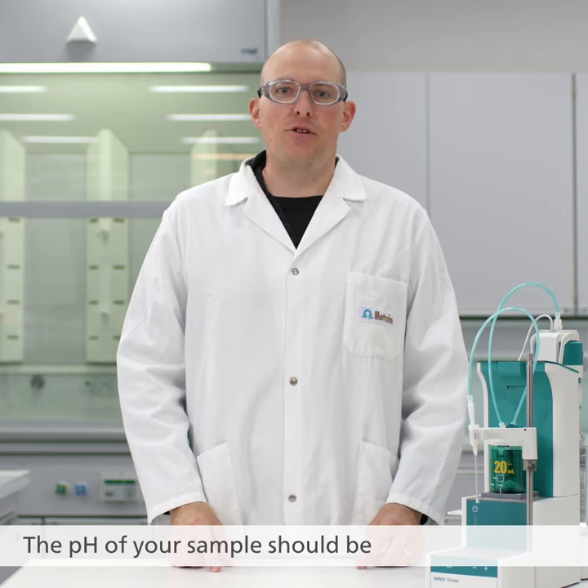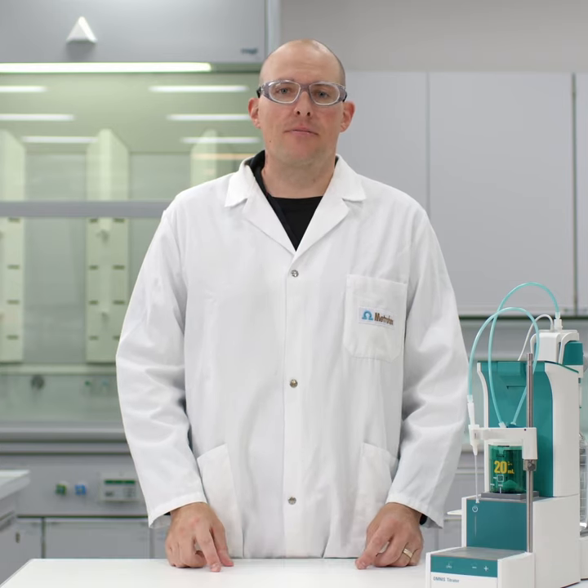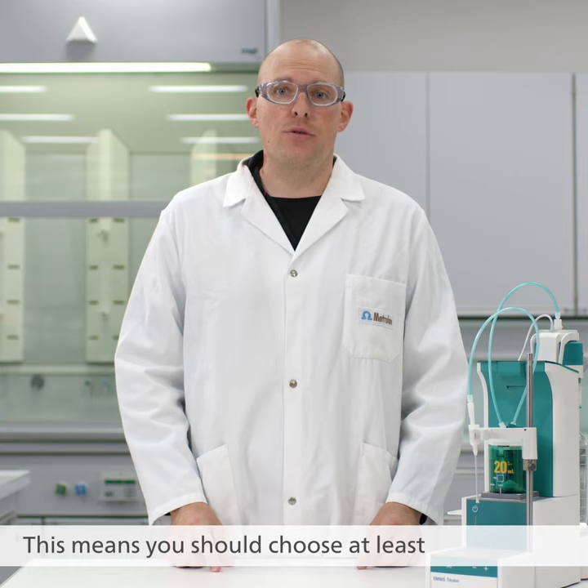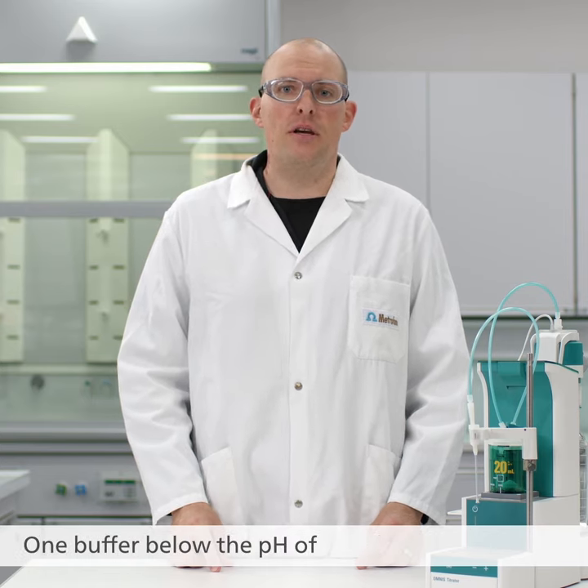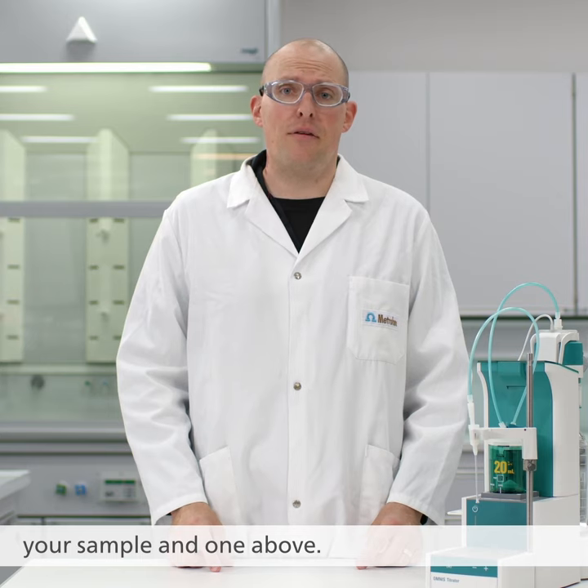The pH of your sample should be within the calibration range. This means you should choose at least two buffers for your calibration — one buffer below the pH of your sample and one above.